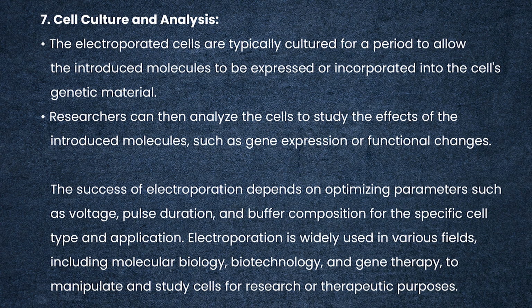Researchers can then analyze the cells to study the effects of introduced molecules, such as gene expression or functional changes. The success of electroporation depends on optimizing parameters such as voltage, pulse duration and buffer composition for the specific cell type and application.